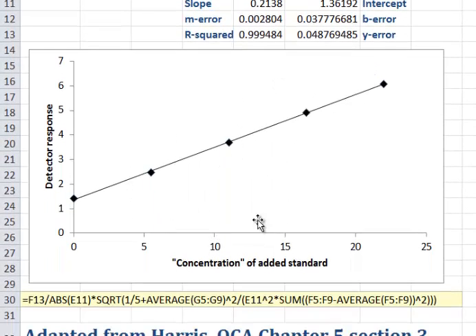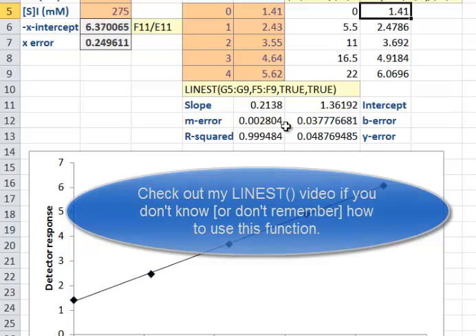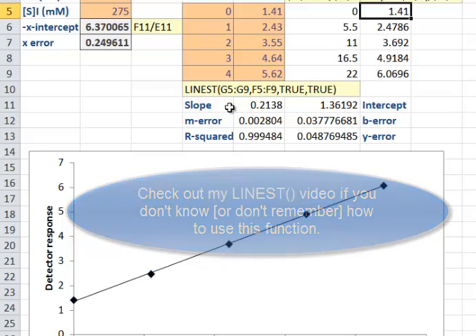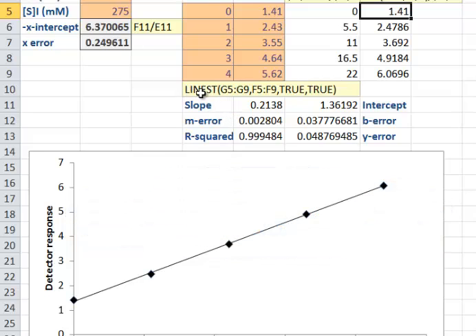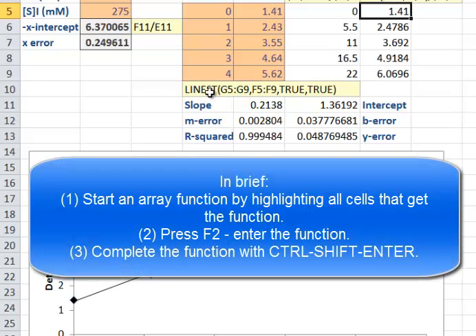I plotted those and fancied up the graph to get the concentration of the added standard and the detector response. We get a nice straight line. I use the LINEST command to figure out the slope and the intercept plus the corresponding errors for this best fit line. Remember this is an array function. We've talked about array functions in the past, so I'm not going to discuss them at this point. There is another video to take a look at that if you'd like.